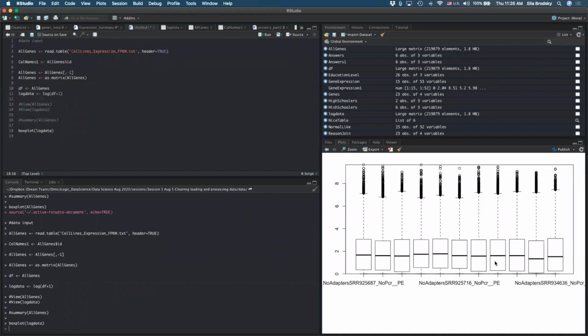So again, here I start visiting, and obviously I can make this plot a little bit better. You already know how to do this. For example, I can give it a name, right? So what is the name? It's going to be like this. So the name would be, this is log transformed gene expression.